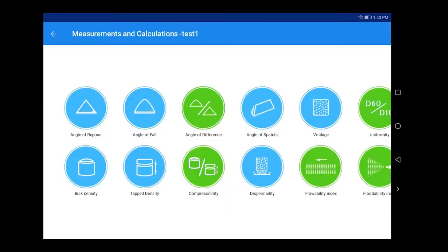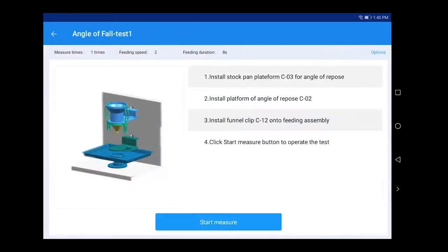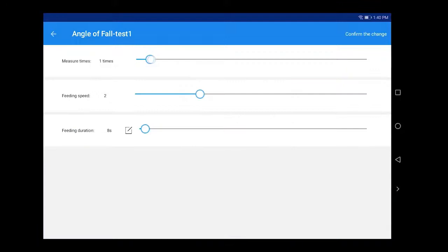Angle of repose will be automatically achieved during angle of fall measurement. Click Angle of Fall. Click Options, and set measure times, feeding speed, and feeding duration as required.